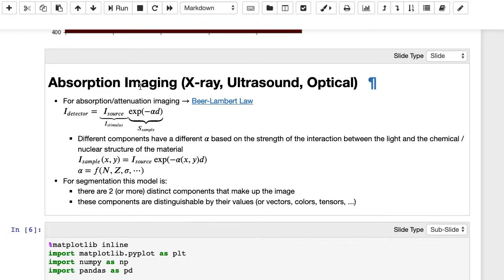And so this very commonly comes into place in X-ray imaging or cellular imaging, where you're shining a light through, and the interaction with the sample is simply absorption or attenuation. And so here we have the simple model, where it's just exponential decay, and so the thicker your sample is, the more it absorbs. We also end up with more complicated setups where you can have changing materials. You can have materials that respond differently to different wavelengths, and so if you're using white light illumination, you might have to take that into account. But typically, we just look at this exponential decay.